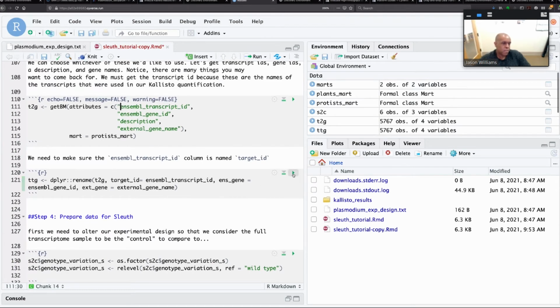So what it's doing in this step at 120 is, remember a moment ago, I showed you the list of counts for those falciparum gene names. And it looked up all of those gene names in my transcripts and then went to Ensembl and found the corresponding gene name plus any other of that information, those attributes that Ensembl has. So that way I could have a better annotation than what I ended up with. Okay, let's go back to sharing.